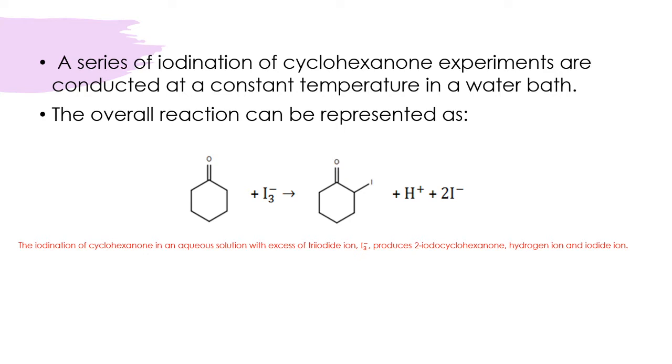It's possible to follow the reaction by measuring the concentration of any of the reactants or products as a function of time, but we can simplify things by choosing the most convenient measurement.